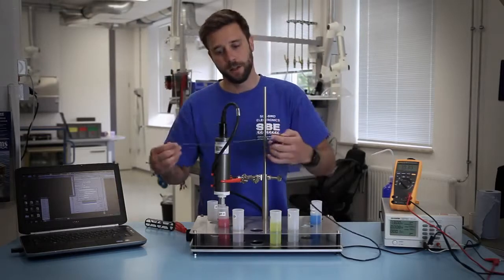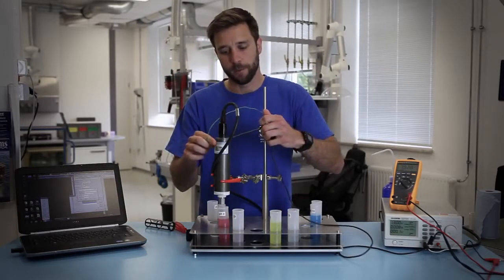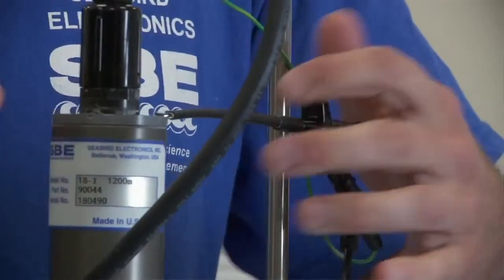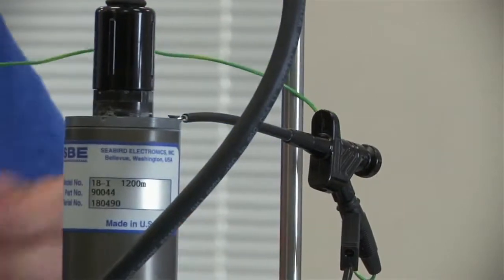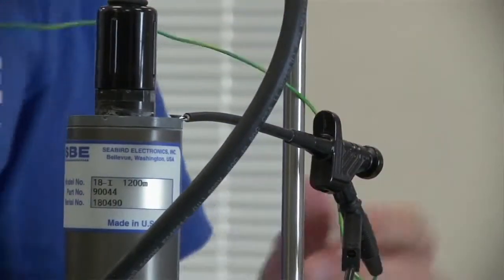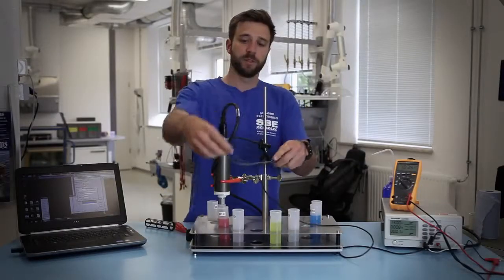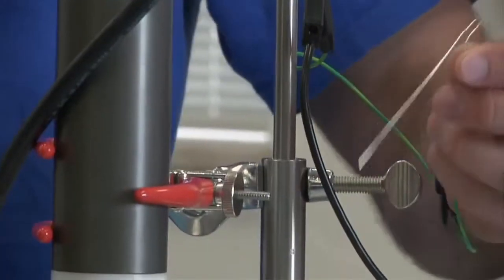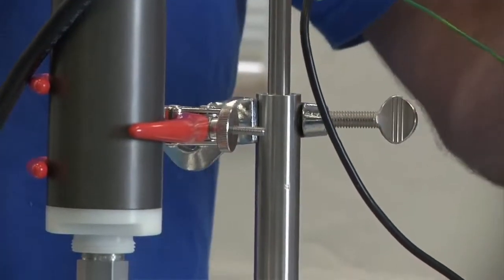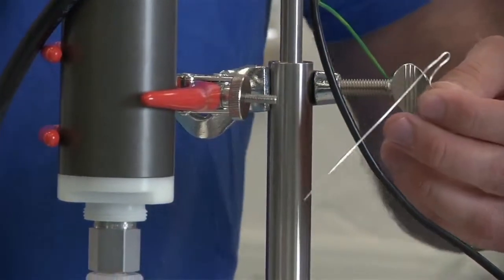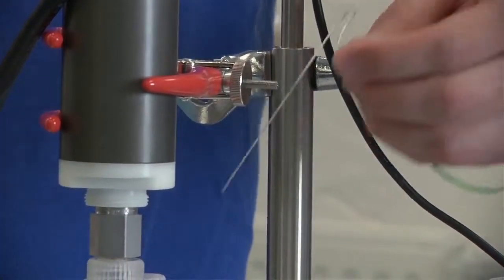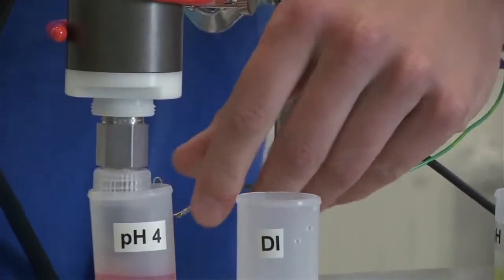This is normally done when the sensor is in the water as a circuit is formed between the housing of the instrument and the probe and the seawater. But since we're doing this on the bench we need to create that ground loop using a piece of stripped bus wire that connects to an anode screw on the housing and into the solution itself.